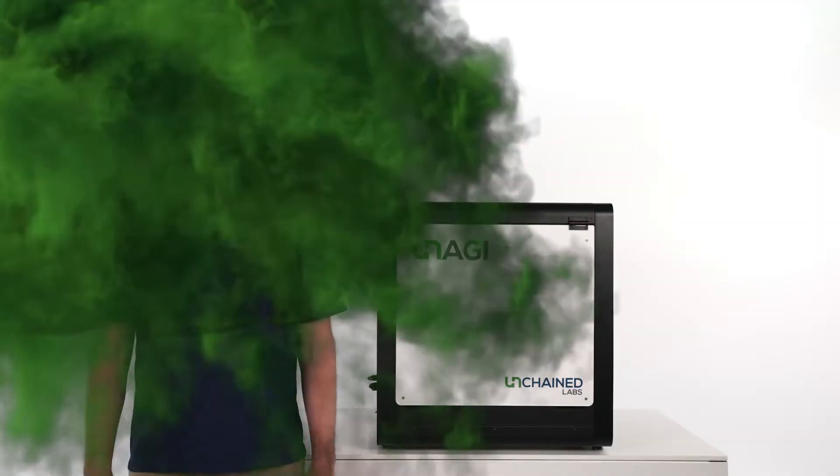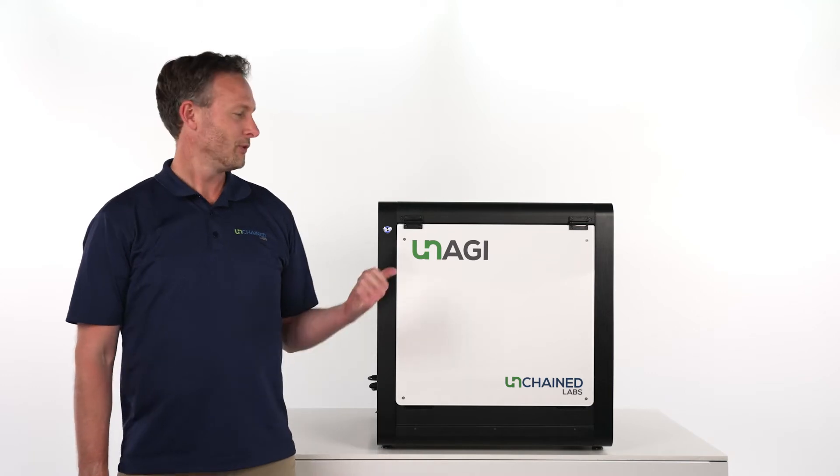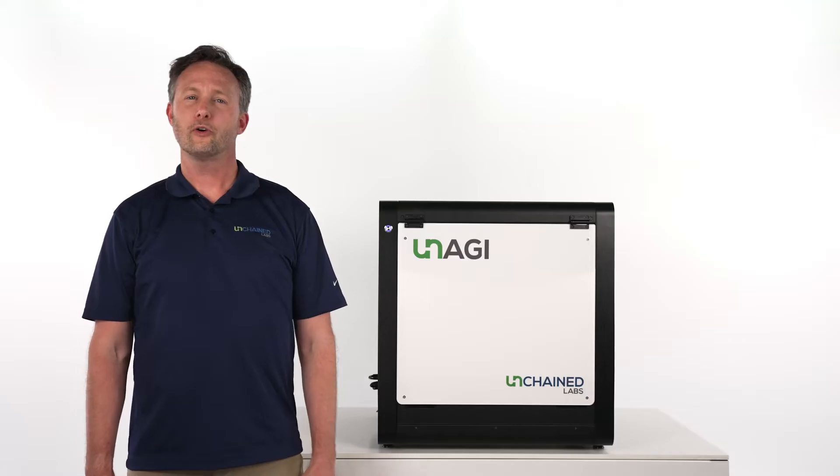Unagi — my favorite. Hi, I'm Del Rey, and I'd like to introduce you to Unagi, the world's first completely hands-free benchtop buffer exchange solution.